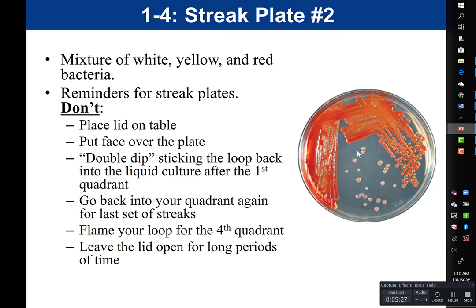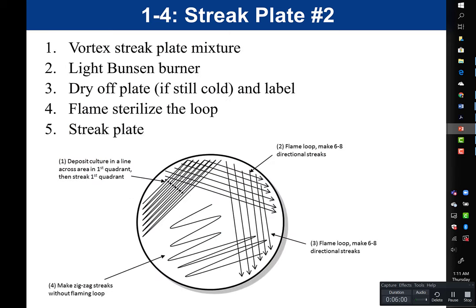Don't leave your lid open for long periods of time — only open it when you're ready to do your streaks, then close it right away. When you're not working with your plate, always keep it agar side up. Only flip it to agar side down when you're ready to streak, and immediately after you're done, flip it back to agar side up so condensation doesn't sit on the agar. This is how we streak for isolation — how we isolate bacteria from a large mixed culture to study individual bacteria.